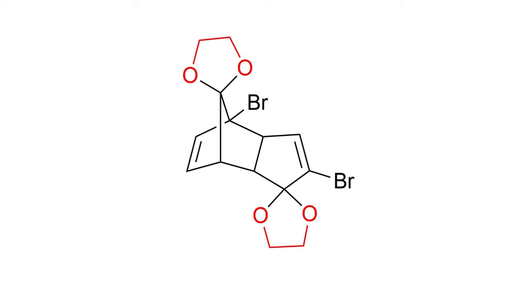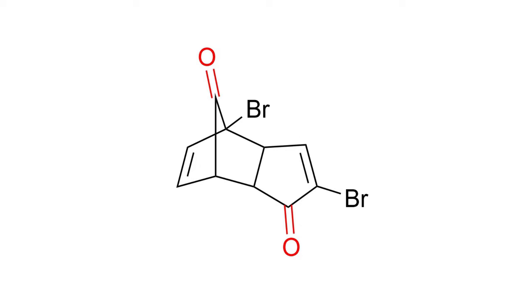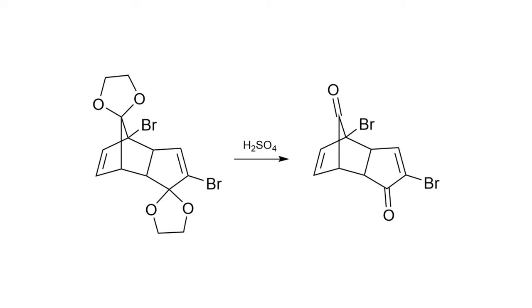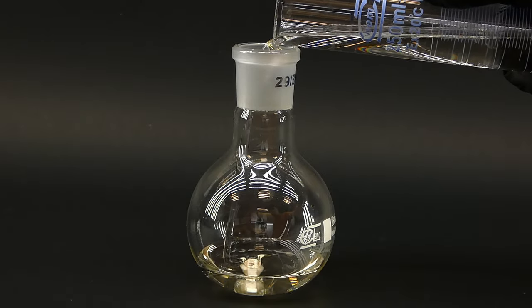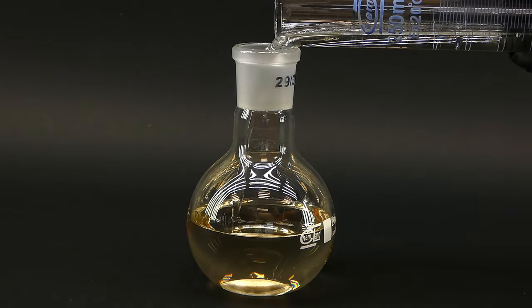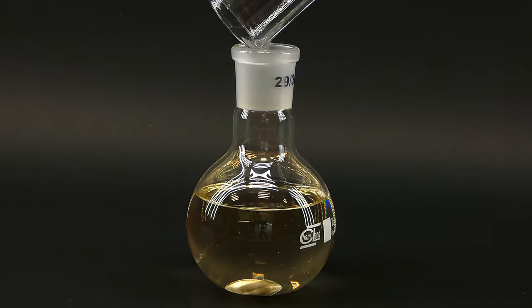It has two ketal groups that I installed in the first video — that's also why I call it the diketal — and now they have to go, because they would just make the next steps more difficult. To remove them and create the diketone, I have to use some concentrated sulfuric acid, and to start I poured 200 ml of 96% sulfuric acid drain cleaner into a flask with a stir bar.